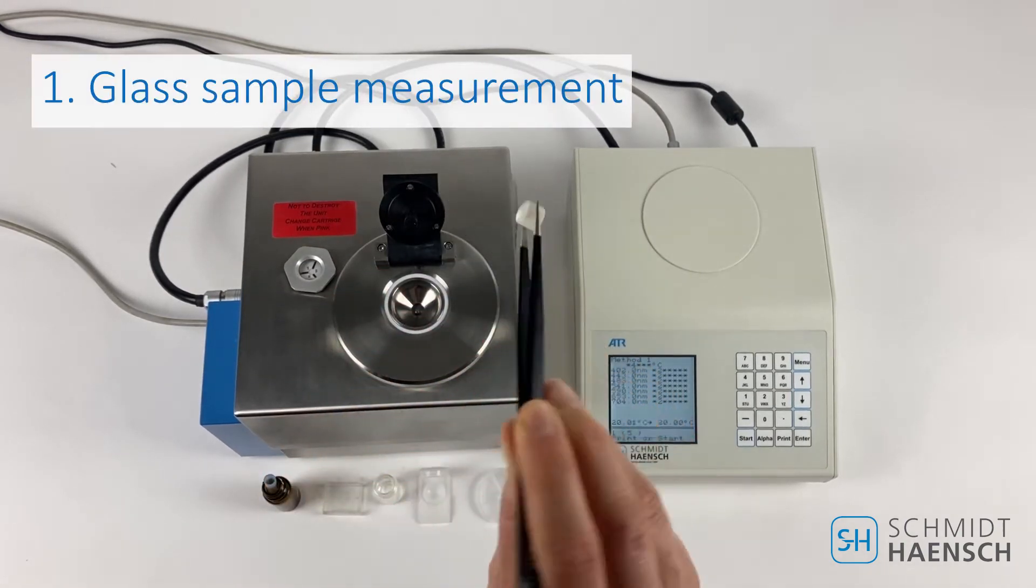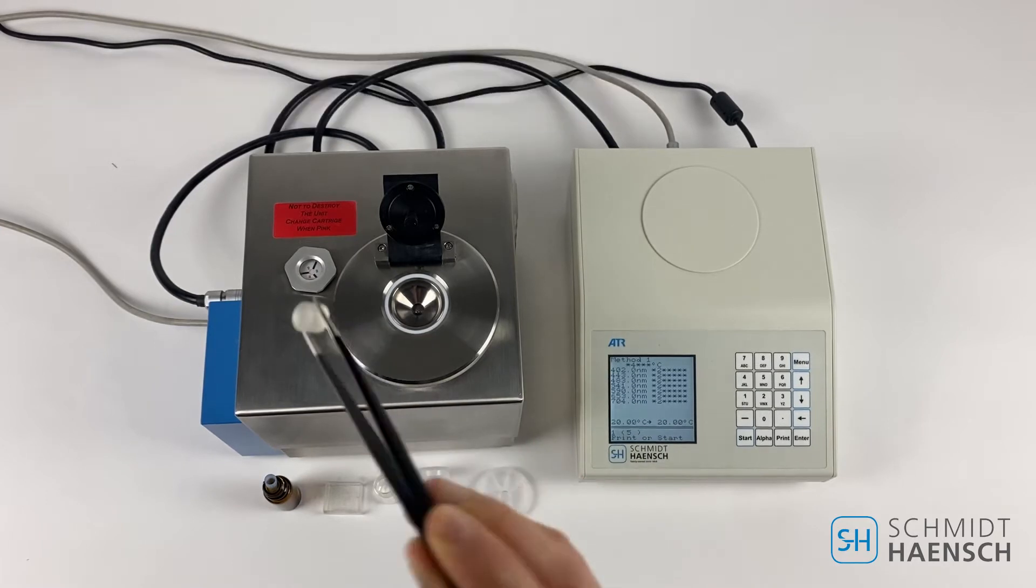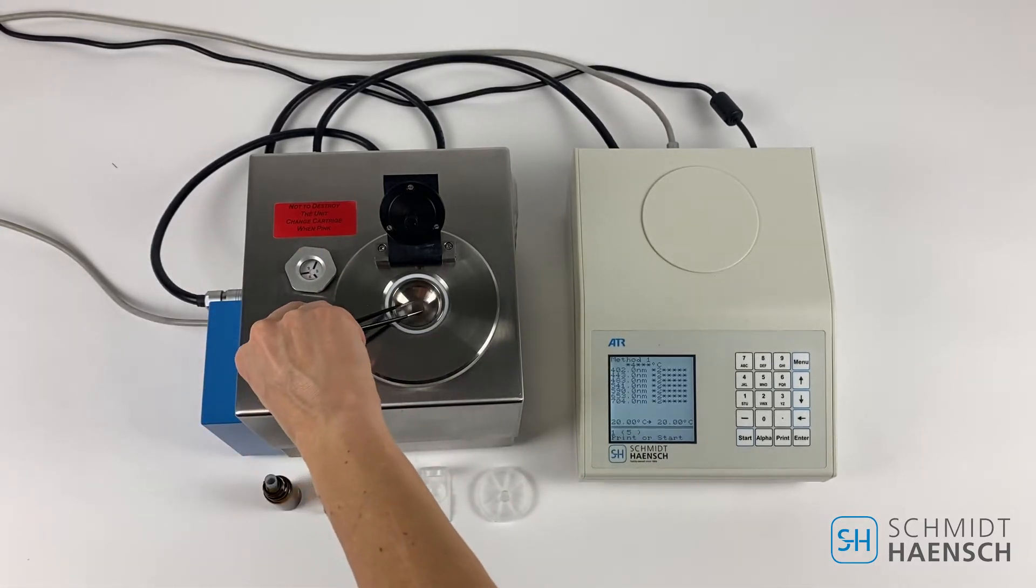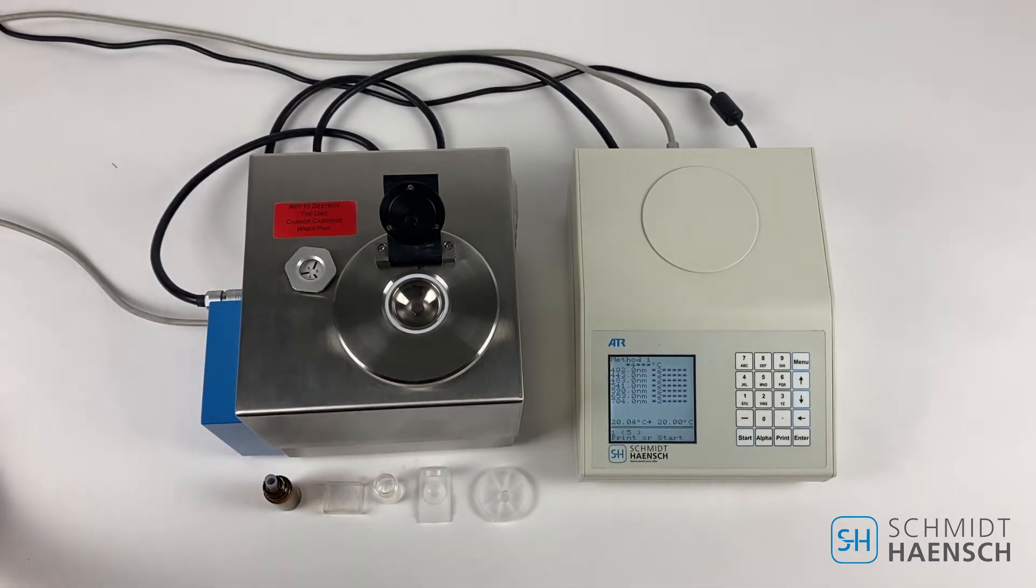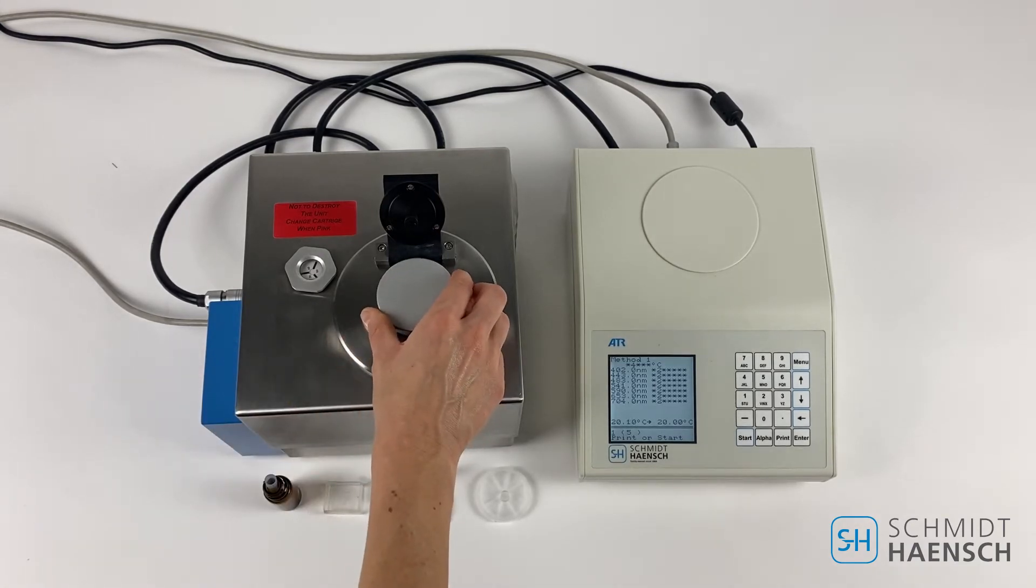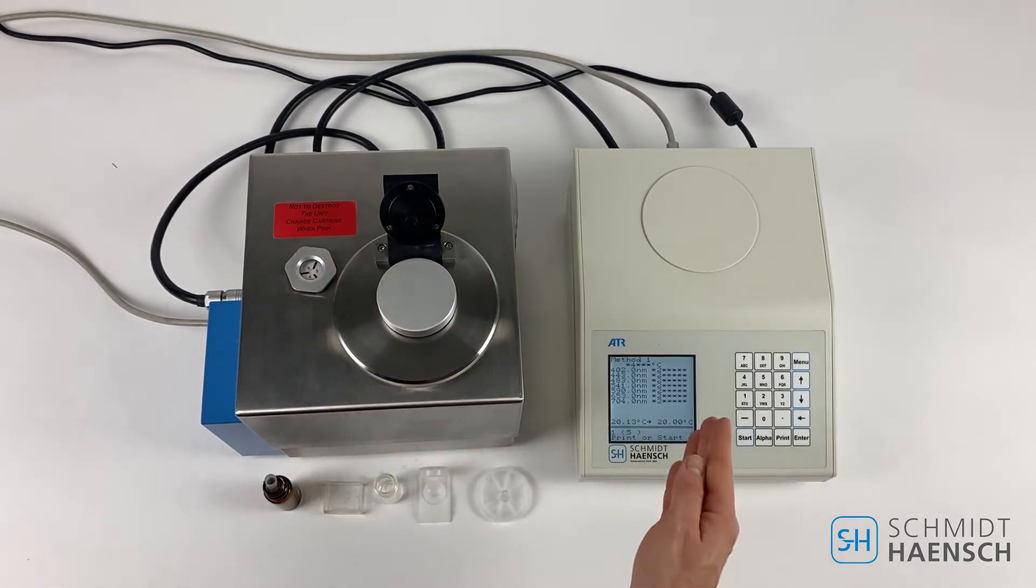We will use a solid glass sample which is polished on one side. This will be put onto the prism surface of the instrument. Close the lid, press the start button.